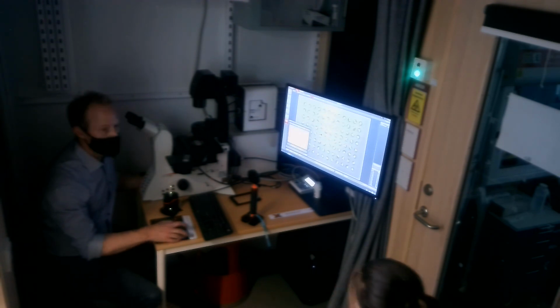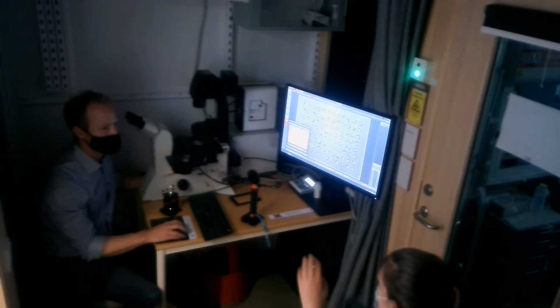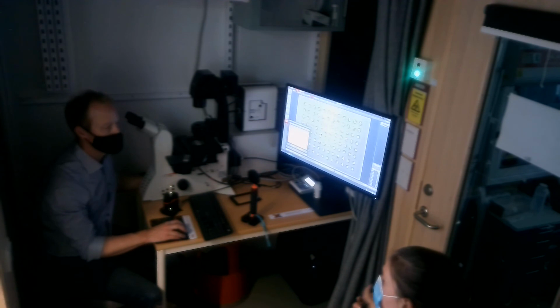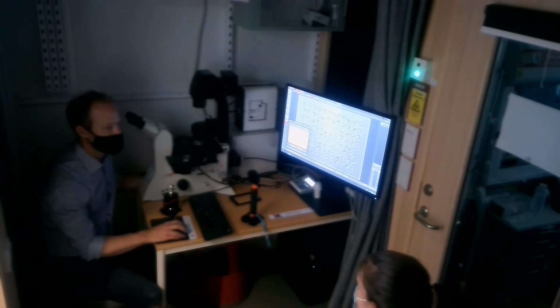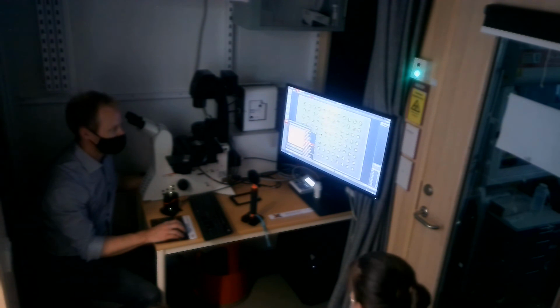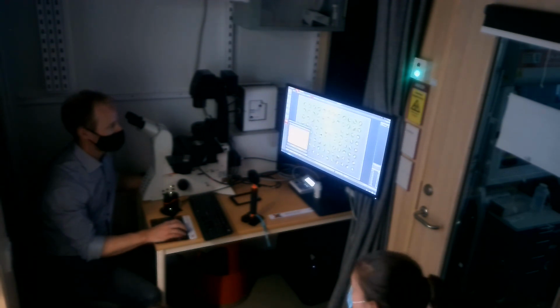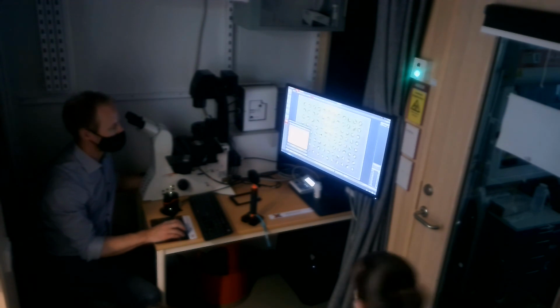So I guess when we use one of the already saved plates which are there, everything is set, the space in between the wells and everything. Yeah. What if we have to add one? Yes, that's what we're going to do right now. Okay. It is important that you have the correct measures, otherwise this will not work at all. Because with some 96 well plates, it might be perfect here, and the last one might be over here, so it's really important, that part.